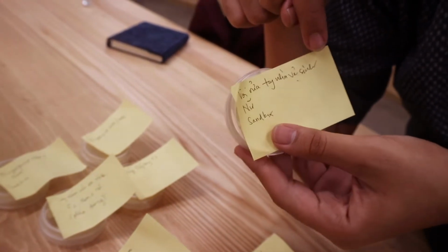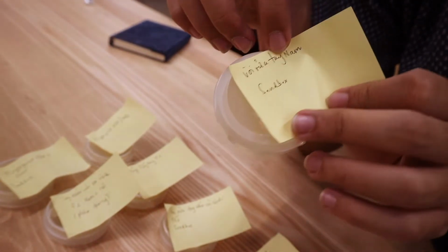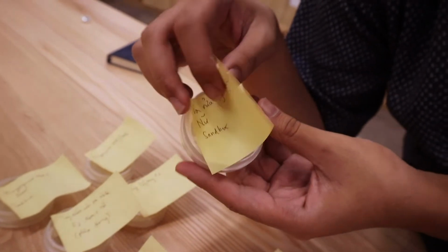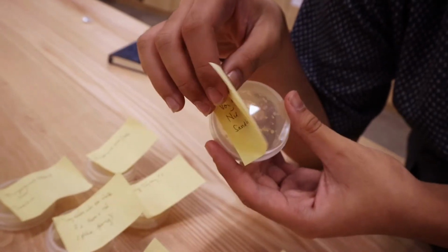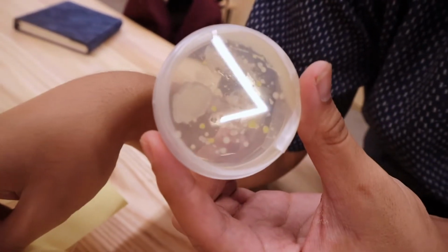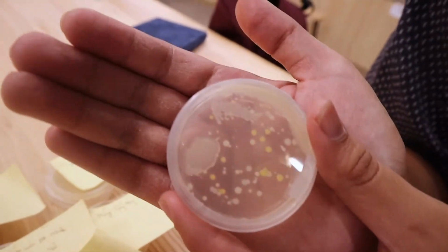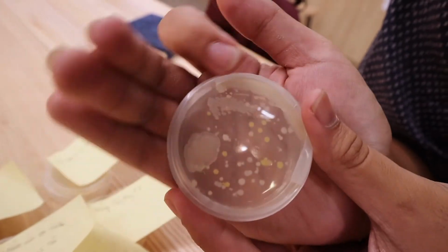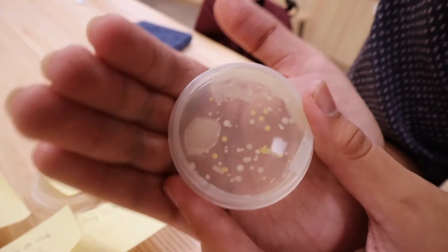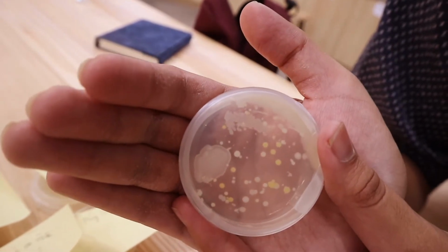Faucet in the girls' bathroom in the sandbox area, and faucet in the boys' bathroom. Let's see the ladies first. Maybe compare the two. Yeah, we will compare. Wow, look at this. This is even trippier than the previous ones. You see, there are plenty of strains on this plate. There's E. coli with white blobs. There's this weird thing, this yellow thing. I don't know what it is. You have to check it. But at least 2 strains are found on the faucet in the girls' bathroom.